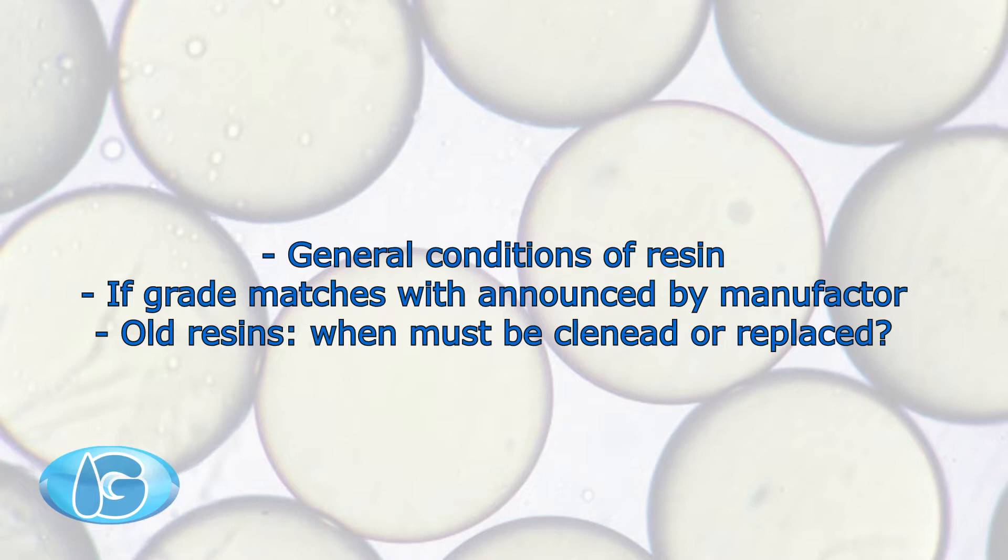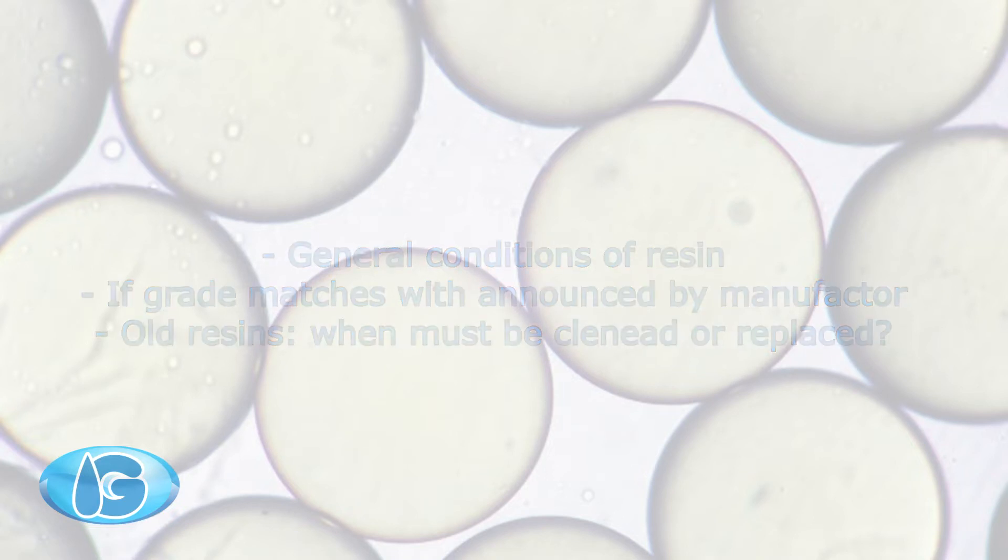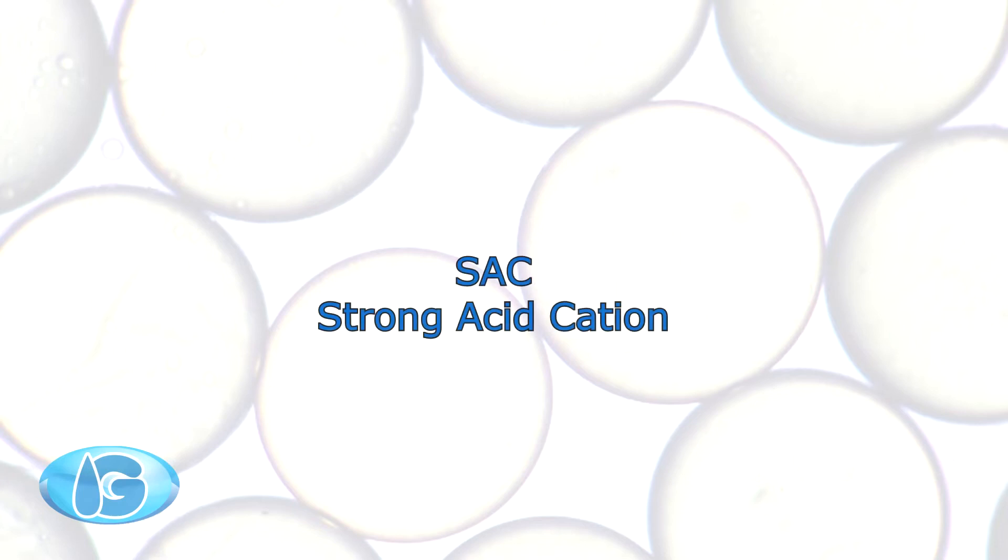All ion resins shown in this video are of the type SAC, strong acid cation.